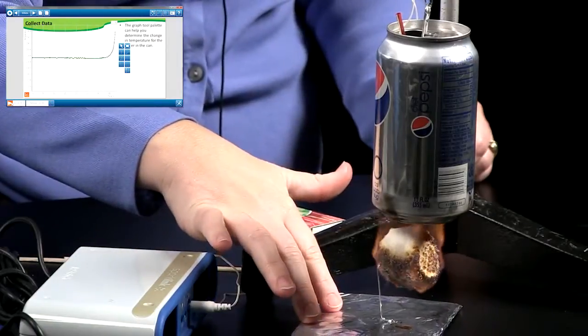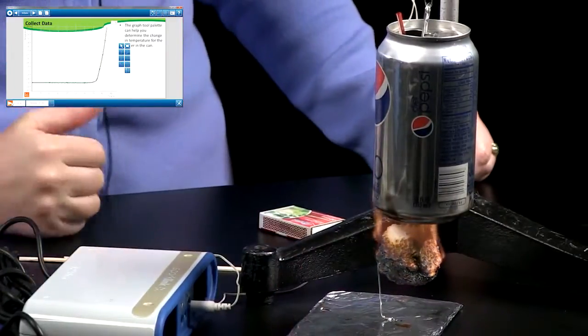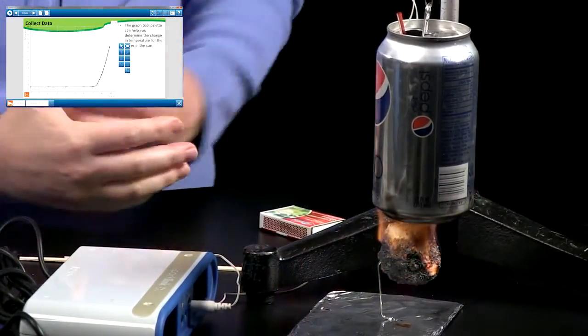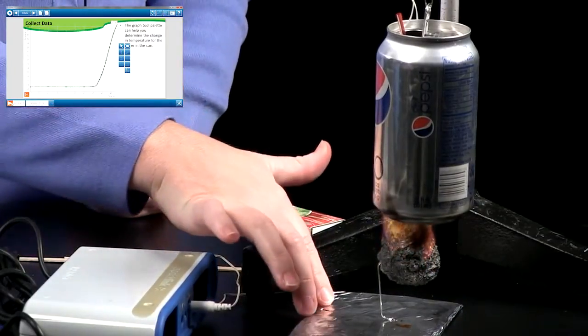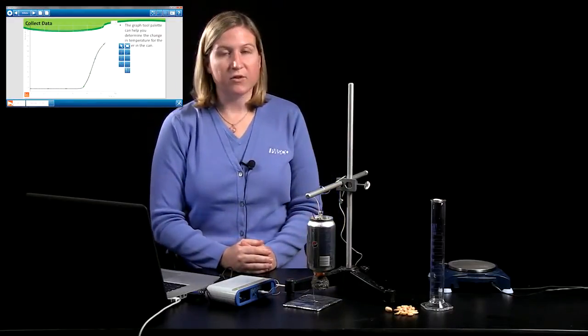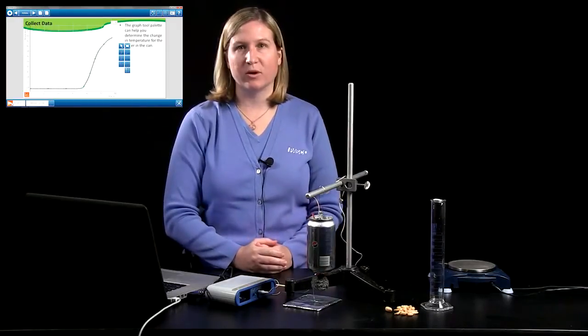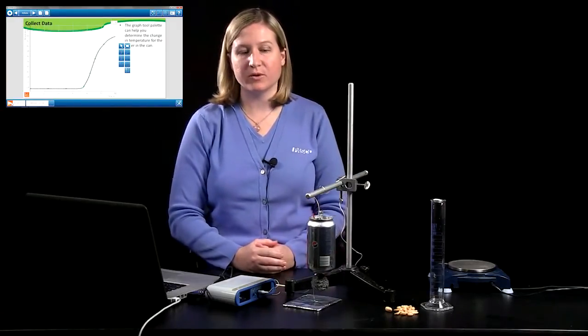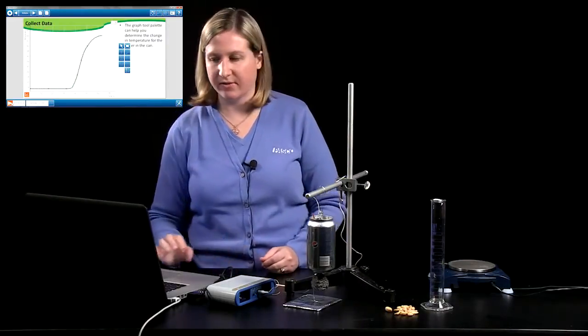As soon as the food is burning on its own, you want to remove the splint. You can always adjust the placement of the food a little bit by moving the holder. You want to keep it as directly underneath the can as possible.